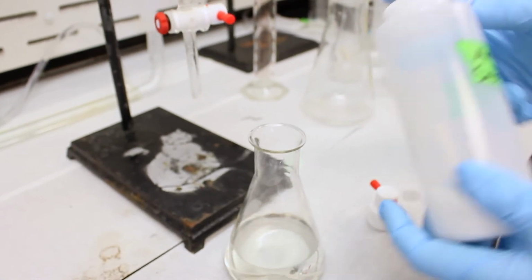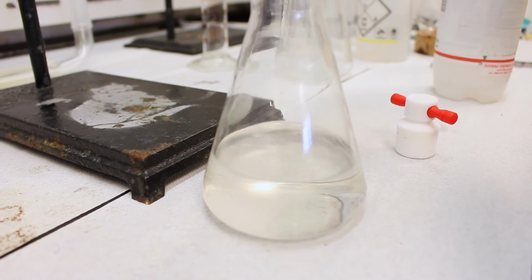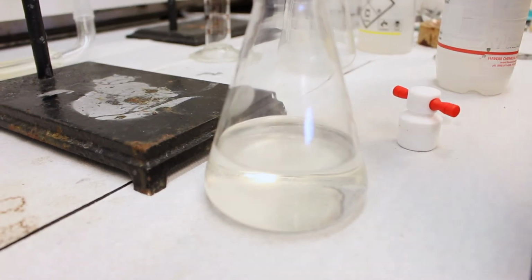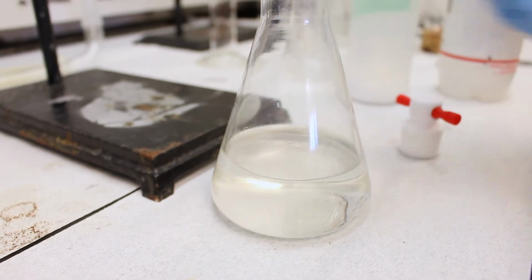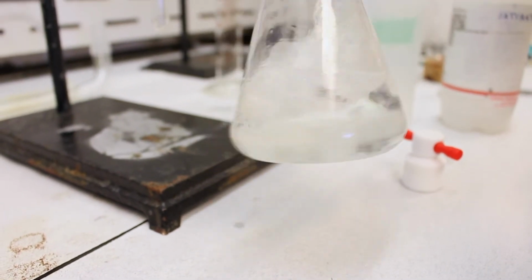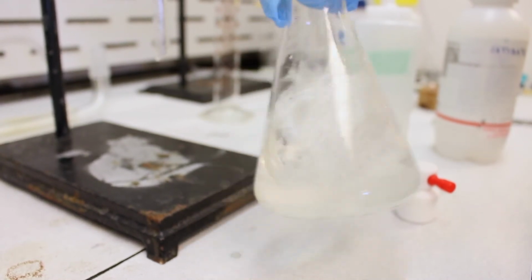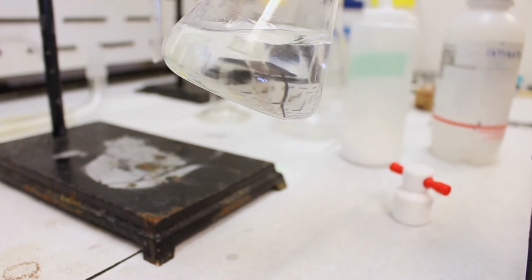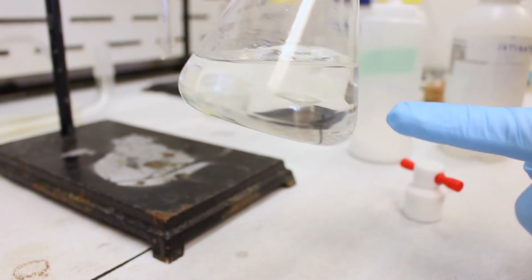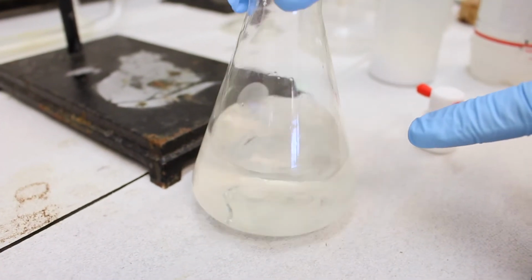Now students always ask how much to add, and the trick is to start with a little bit. Oops, let me add a little more, because there's quite a bit of water in there. And swirl it around. Now when the solution is dry, the liquid will look very clear, crystal clear, and the sodium sulfate will not be clumped together, so it'll kind of look like a snow globe with little particles flying around, but you can see most of it has clumped up and sank to the bottom. So I think we need a little bit more here.